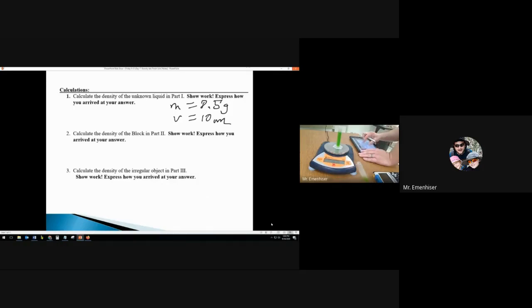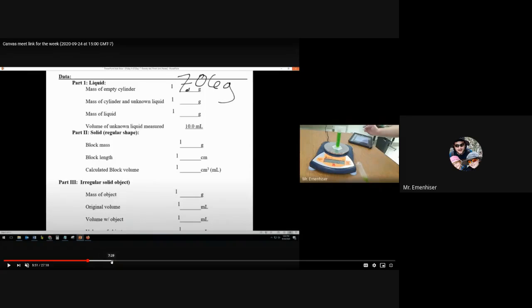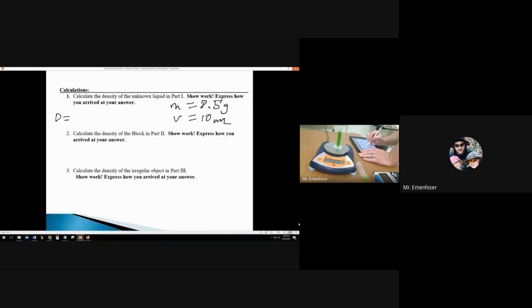Oh, okay, that's when we subtracted them. Okay, let me pause. So 16.40 minus 17, so what was it, 7.06? 7.06. I get 8.8. Okay, either way, we're still off. I'm not sure, but there's a little bit of error here, and I'm not sure where it happened.